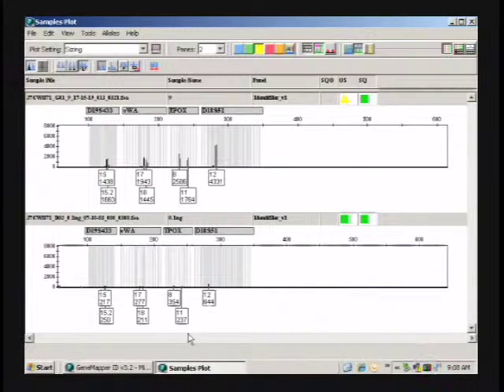And like I said, this 0.1 nanogram, I think everybody would probably use this data. I don't know if any labs have anything that wouldn't. I've heard of a lab, I don't know which lab, that needed it to be over 300 RFUs to be called. So for a lab like that, this 0.1 nanogram sample obviously wouldn't even work, but obviously the cleaned up sample would.